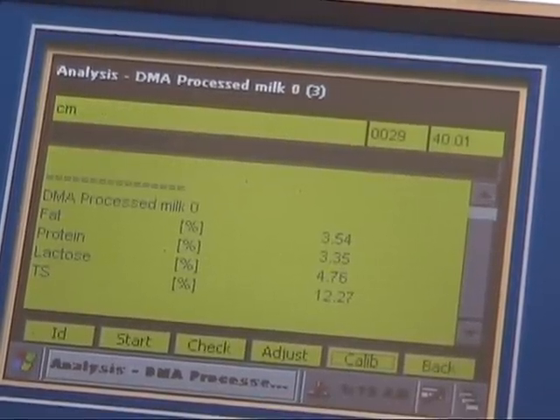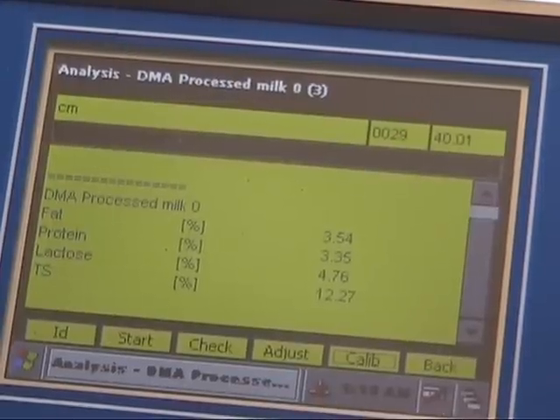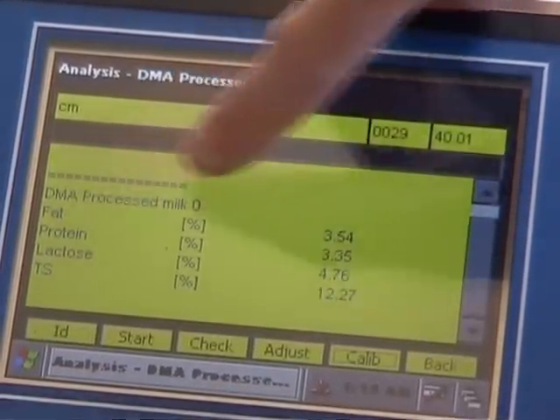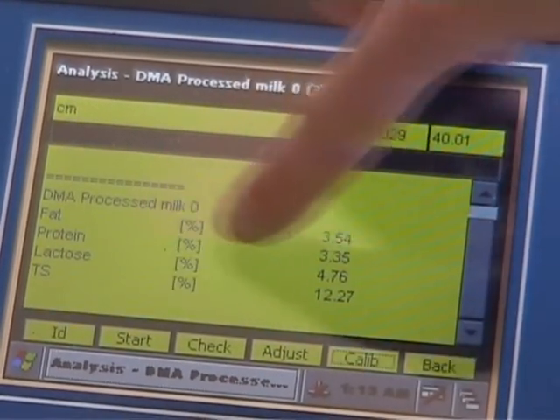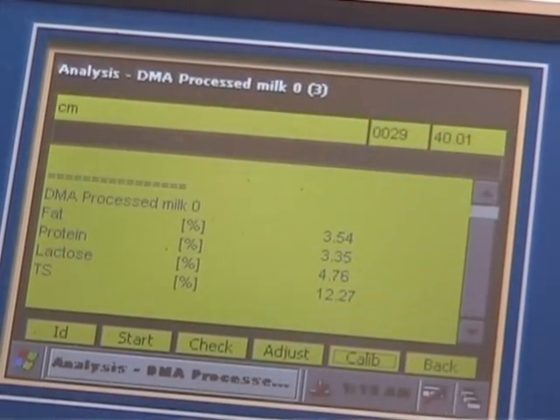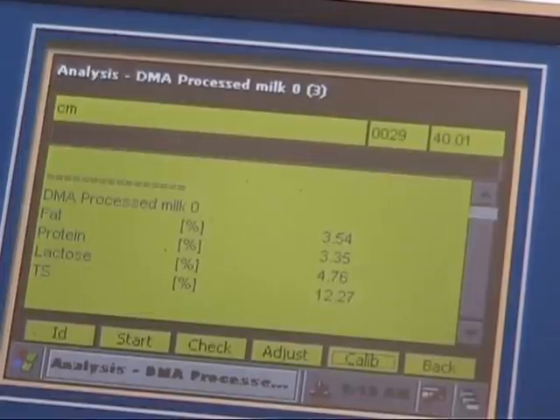When the reading is complete, the results are displayed on the screen. In this case, we have a result for fat, 3.5% protein, lactose and total solids. It's as simple as that.